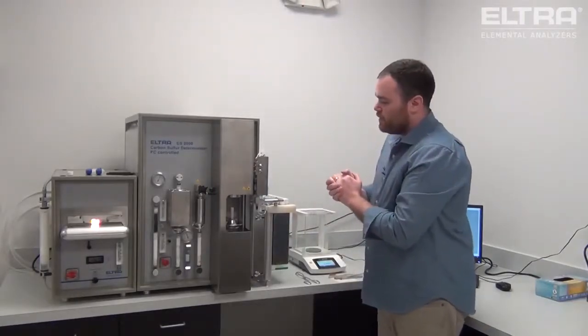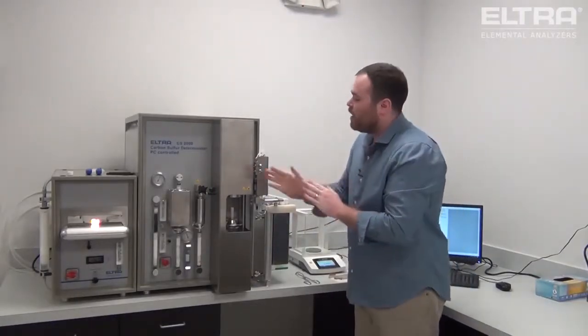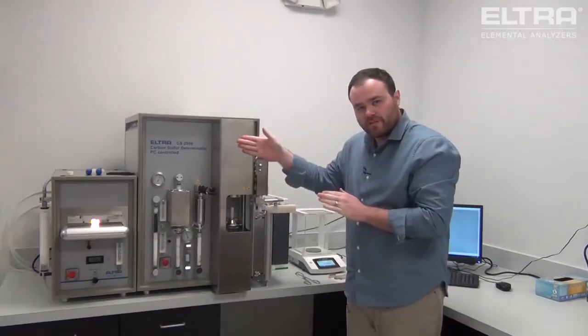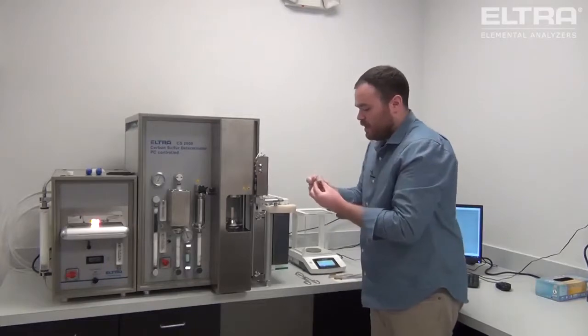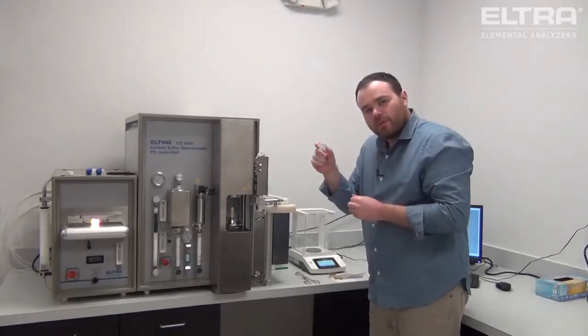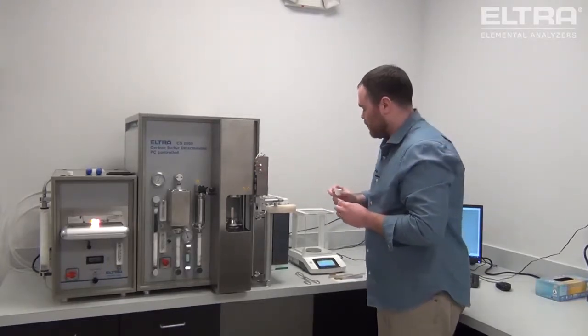Here for the induction furnace, it is a little different as it is a vertical induction furnace. We also have different crucibles here. These are the ceramic crucibles that we use for the induction furnace.